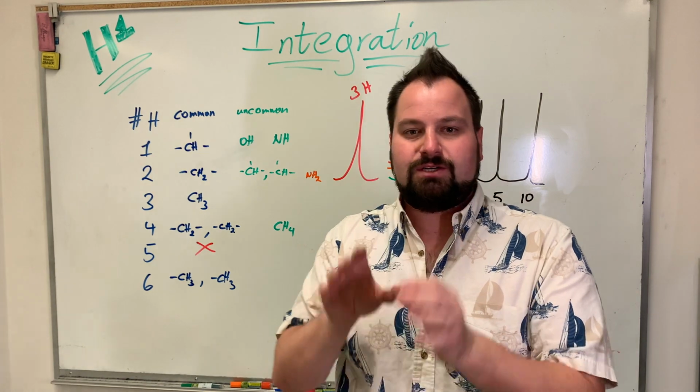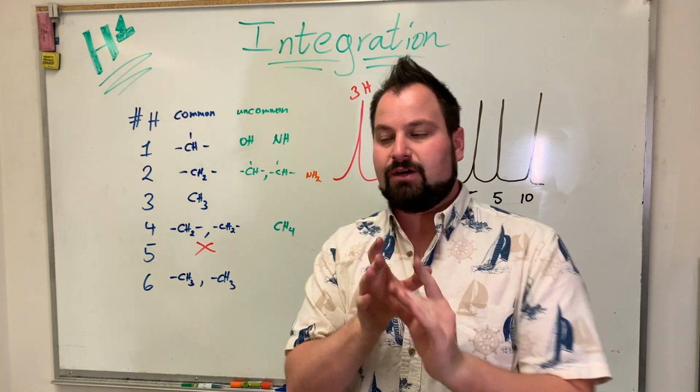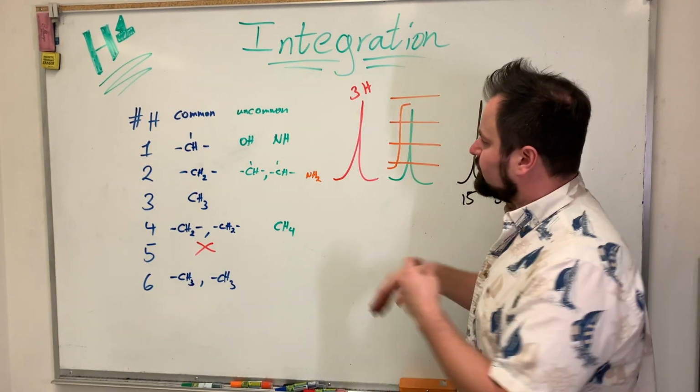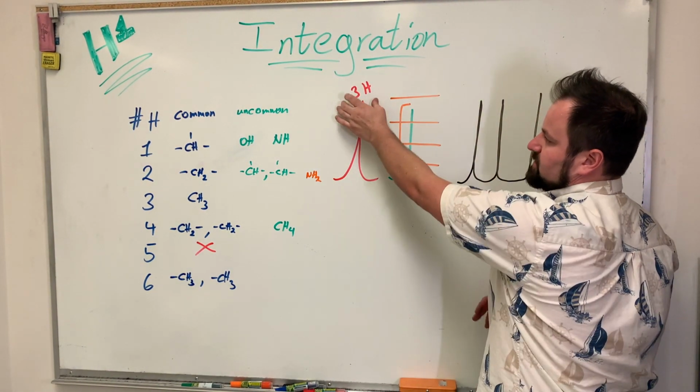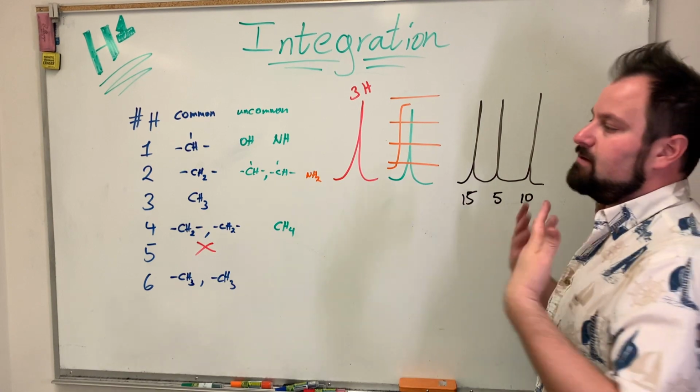So it's the hydrogens on that specific carbon, usually carbon. Okay. Now this can be displayed in a few different ways. It could be that it's just listed on the top. That's a lot of the times what it's just going to be.